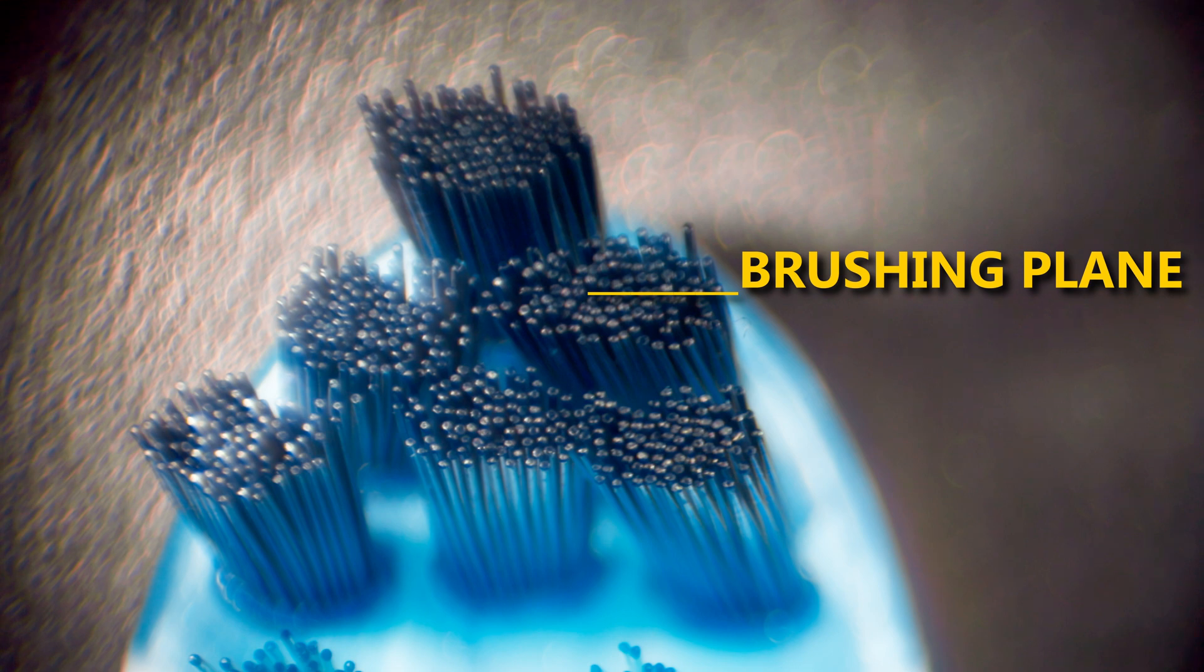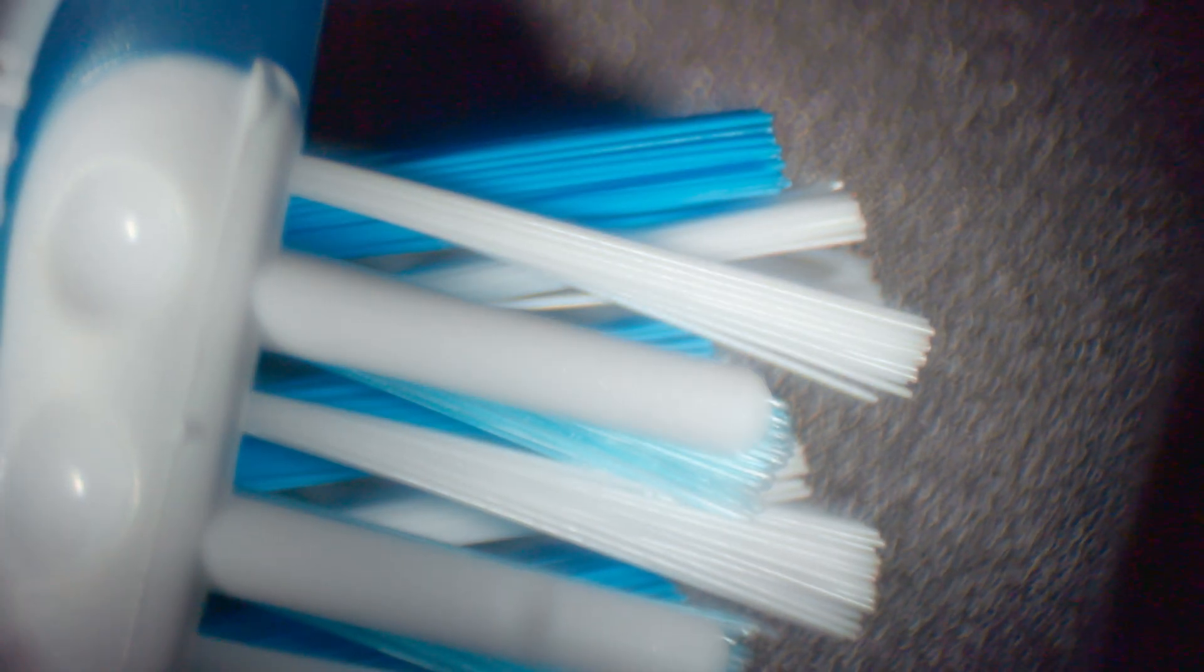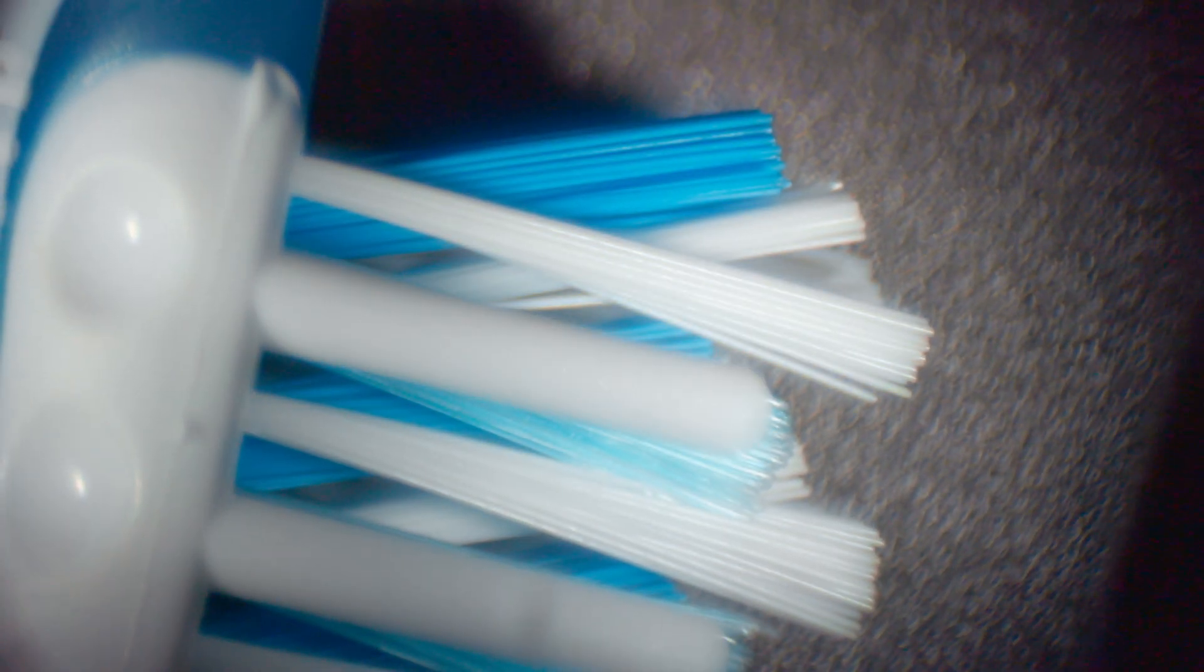When the toothbrush is old, bristles bend and the brushing plane diminishes. And this is the head of the toothbrush where it holds the roots of the bristles. The roots are where gunk such as toothpaste and food pieces accumulates over time. It becomes the perfect place for bacteria to flourish.